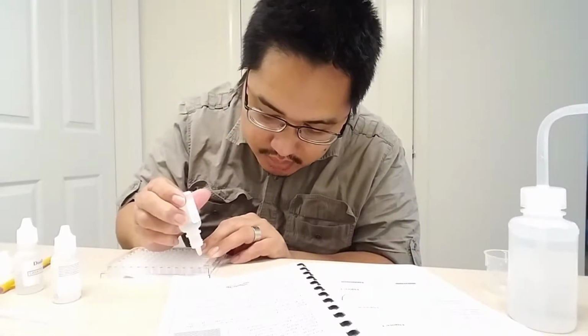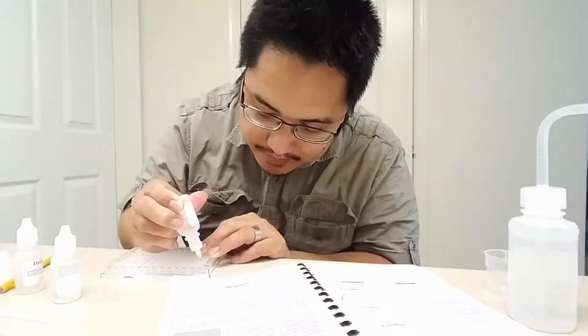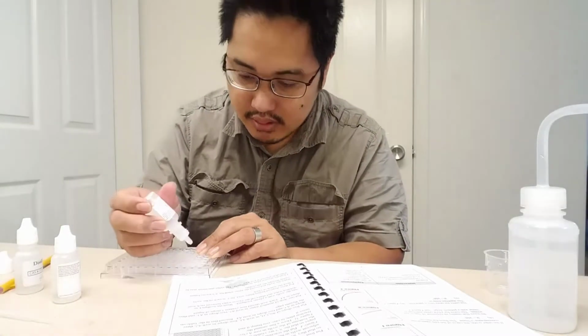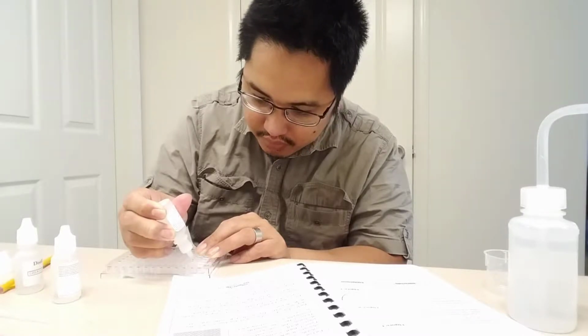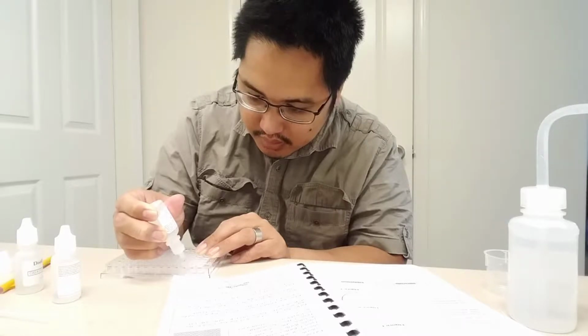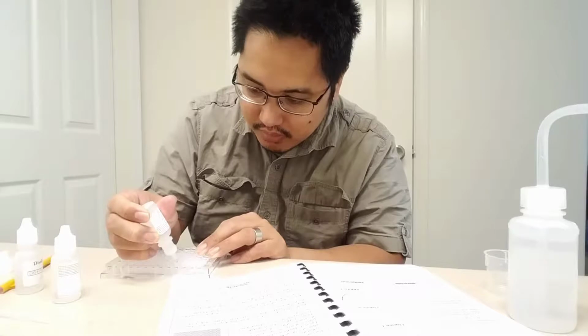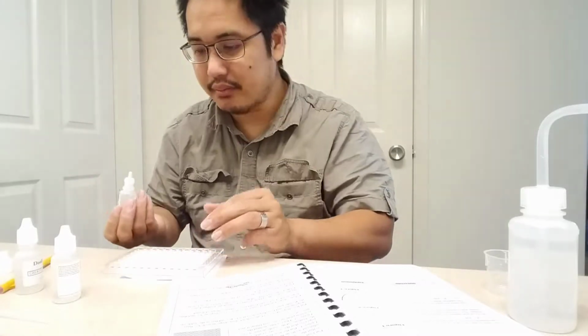That'd be 1, 2, 3, 4, 5. Now I'm going to put 4 drops in well A2: 1, 2, 3, 4. 3 in well A3: 1, 2, 3. 2 in A4: 1, 2. And 1 in A5. There we go.